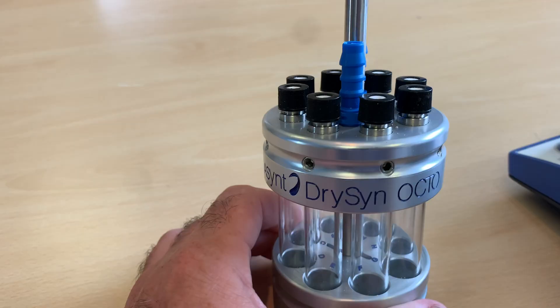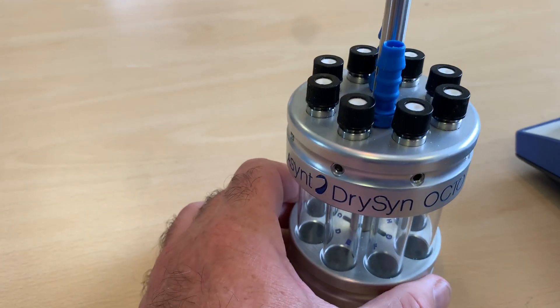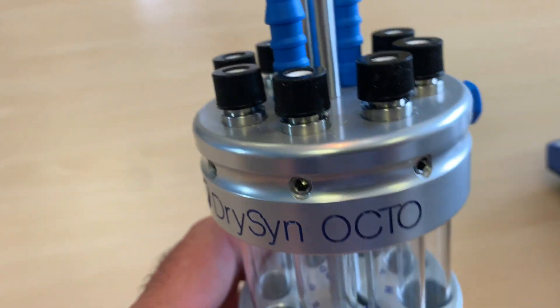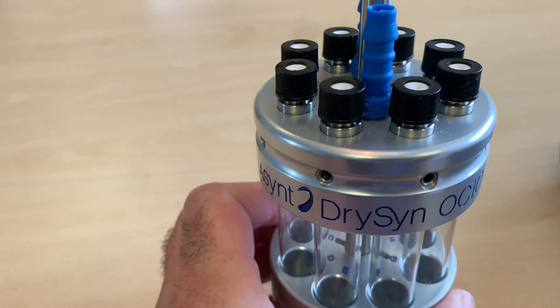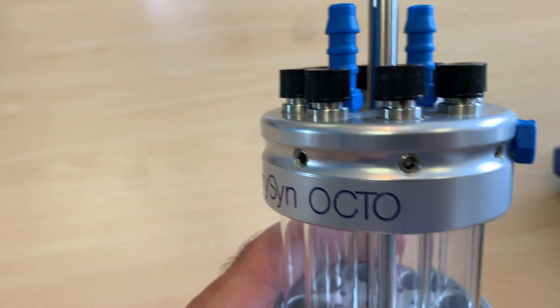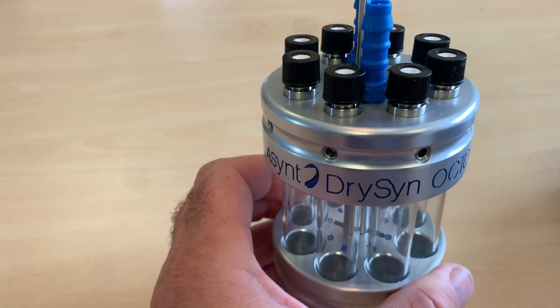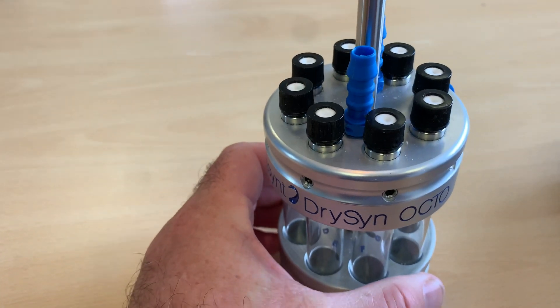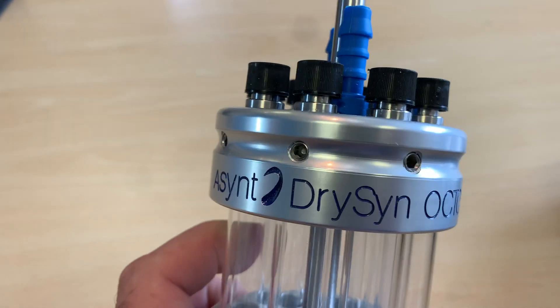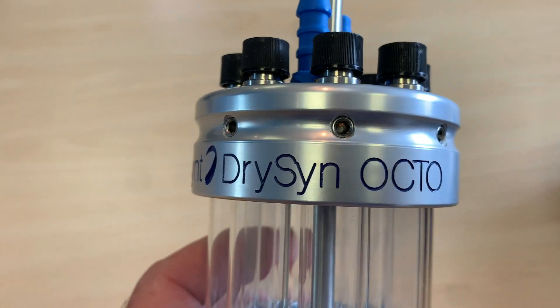As you can see on the Octo, to get the gas into each of the two positions we had to, in an engineering way, drill through the sides and then plug them with these plugs — which is fine, but it's always bugged me as being something that wasn't as gorgeous as it could be.